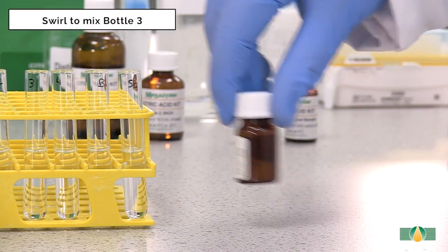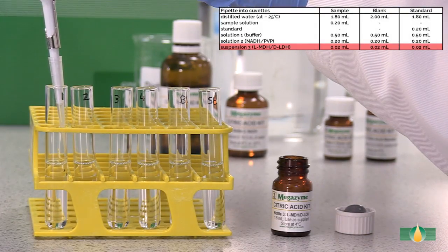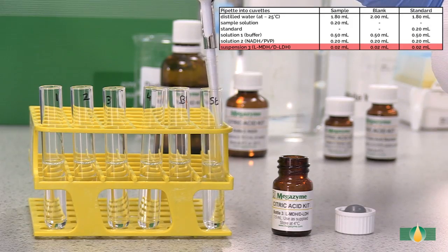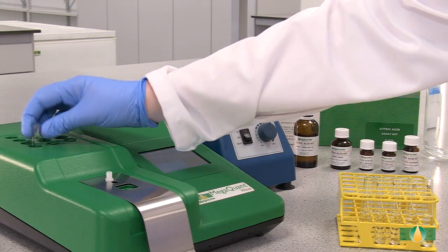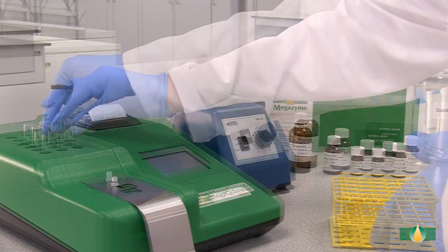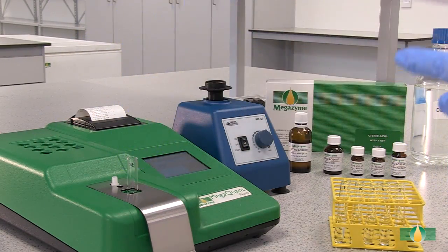Swirl to mix the contents of bottle 3 prior to dispensing. Pipette 20 microliters of suspension 3 into all assay tubes. When all of the components have been added, mix the tube contents thoroughly and incubate the tubes in the 37 degrees Celsius heating block for approximately 4 minutes. After 4 minutes, record the first absorbance reading, A1, at 340 nanometers for all of the assay tubes.